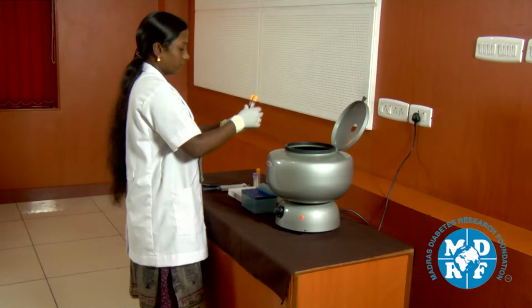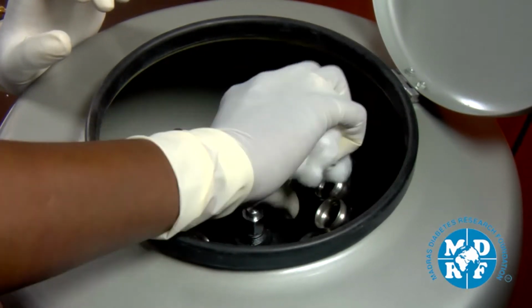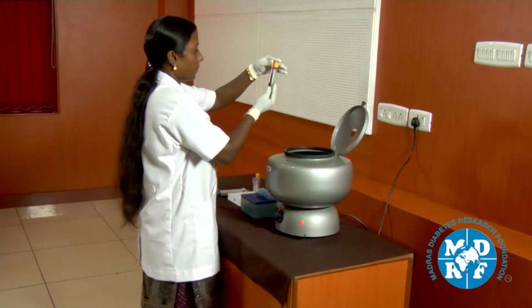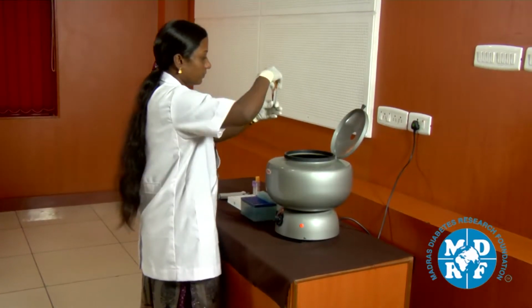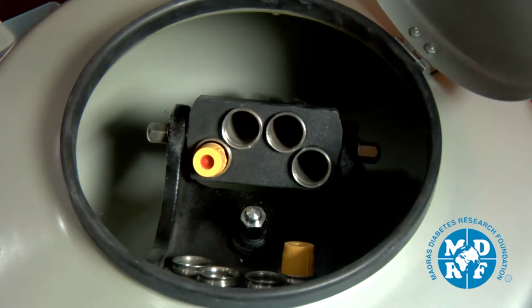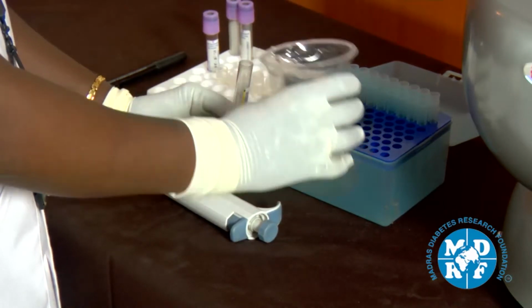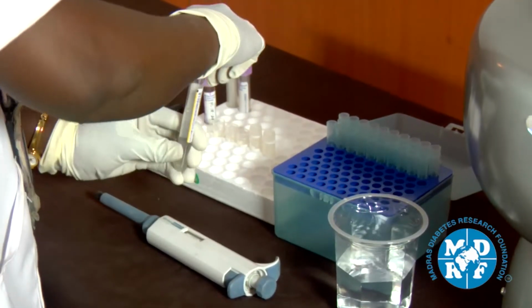The centrifuge should be placed adjacent to a power supply and plugged in and kept on prior to beginning the procedure. Ensure that the rotors are clean before each centrifugation process and that the vacutainer tubes are tightly capped and placed vertically in the slots provided for them. Further, care must be taken to make sure that the tubes are diagonally opposite to each other and that the rotors are balanced at all times. If a balancing tube is required, a vacutainer filled with water can be used.